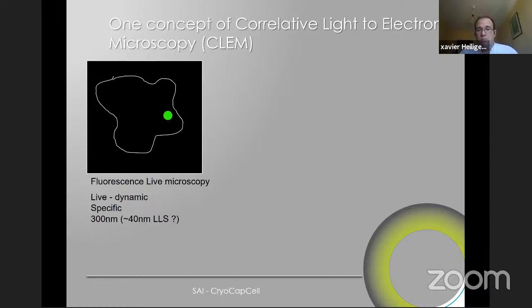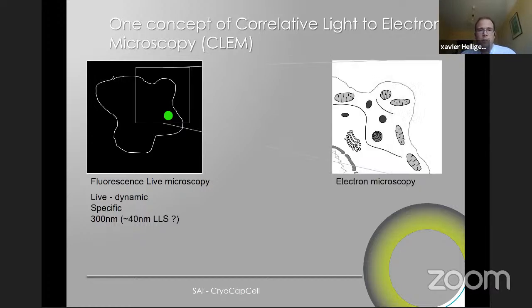Then things are moving in the cell biology field, and in light microscopy we see things moving. But then we want to be able to see that in electron microscopy. Ideally, electron microscopy will give you fixed, contextual information. It could be specific, depending on the technique you're using. CLEM is one of the examples, and we've heard about that from Claudio before. The resolution is, let's say, 5 nanometers in plastic EM, and I will not go into the technical details of that. But ideally, what you want is to overlay the two images to understand what happened before, which is not always possible.